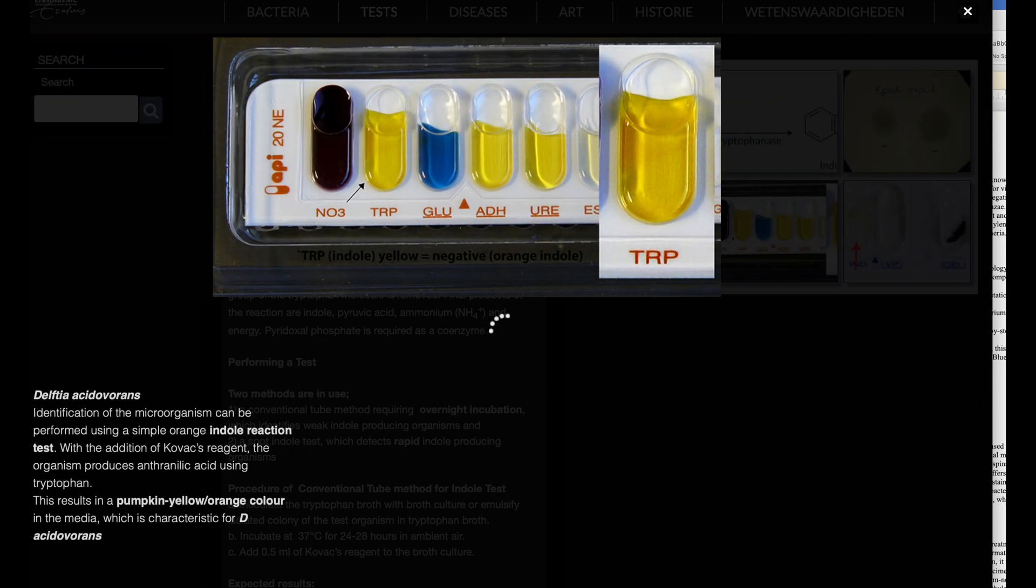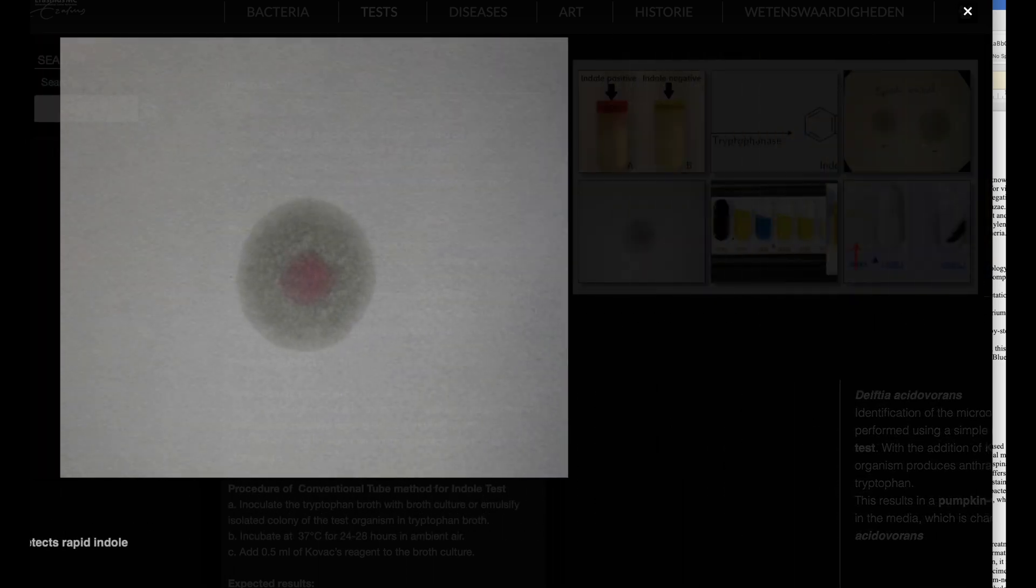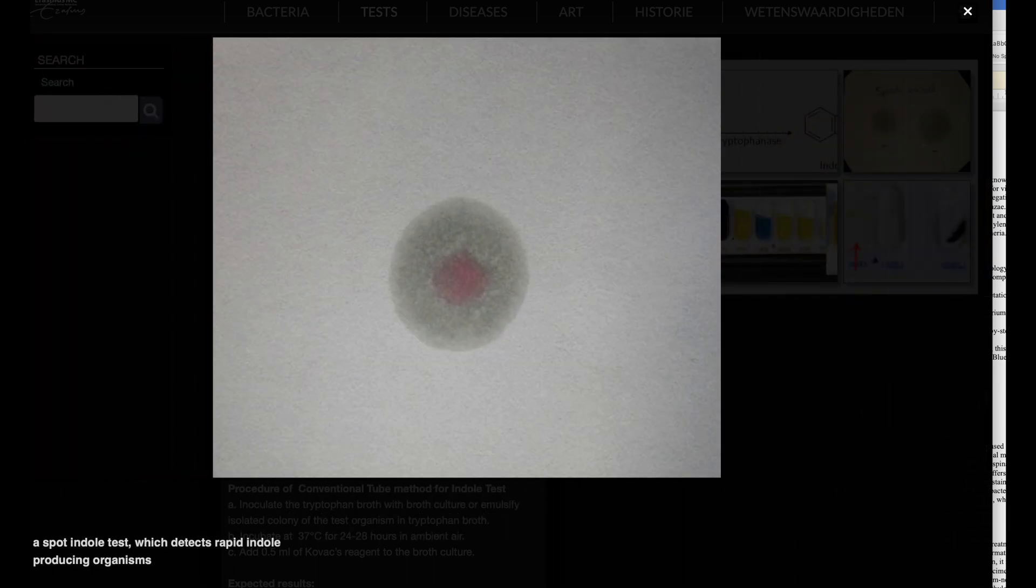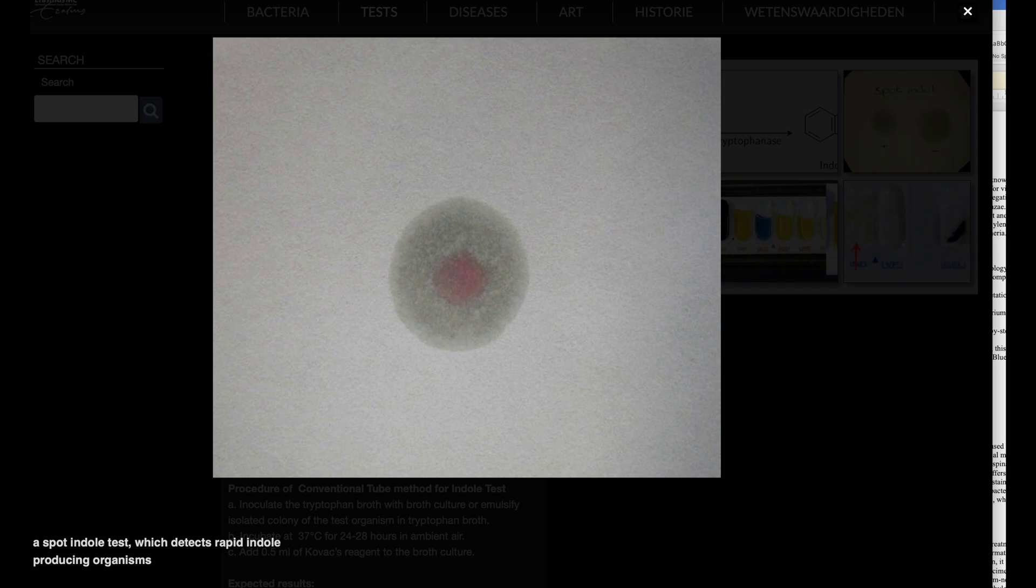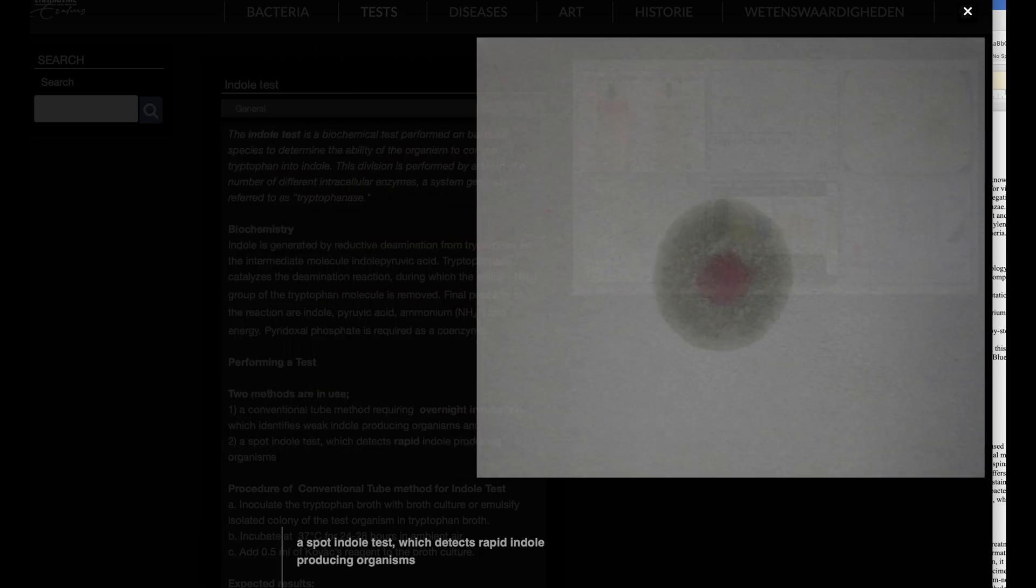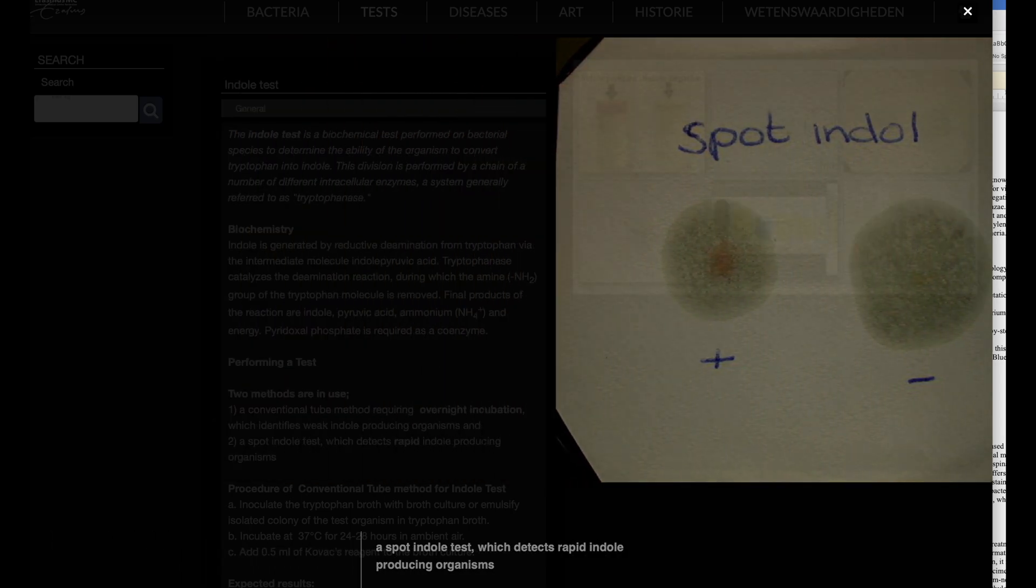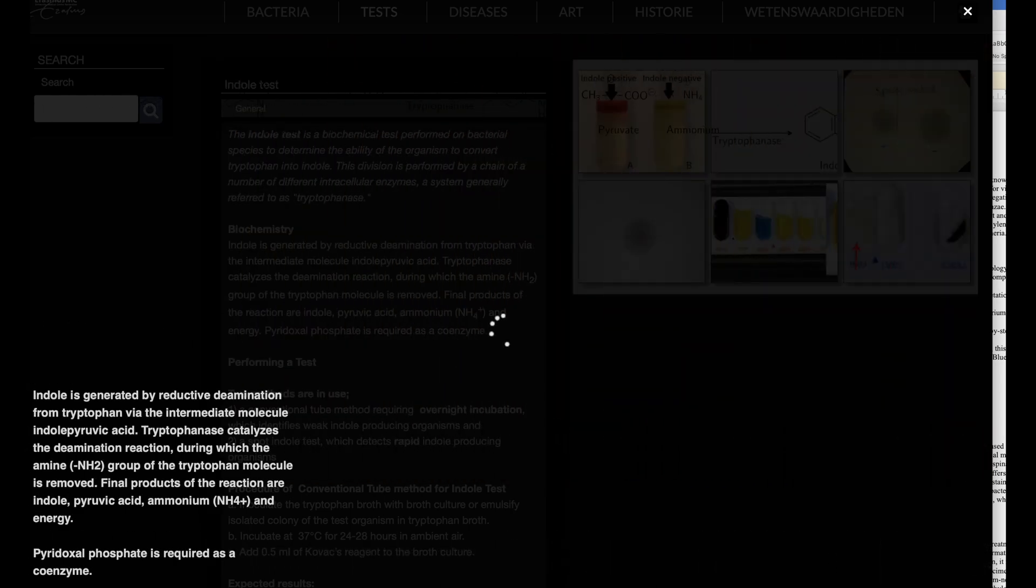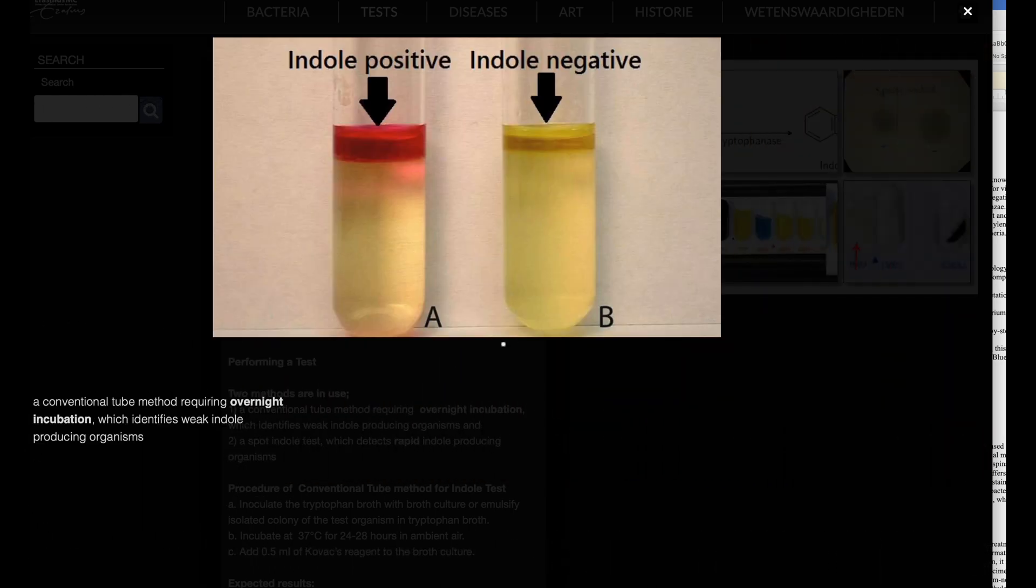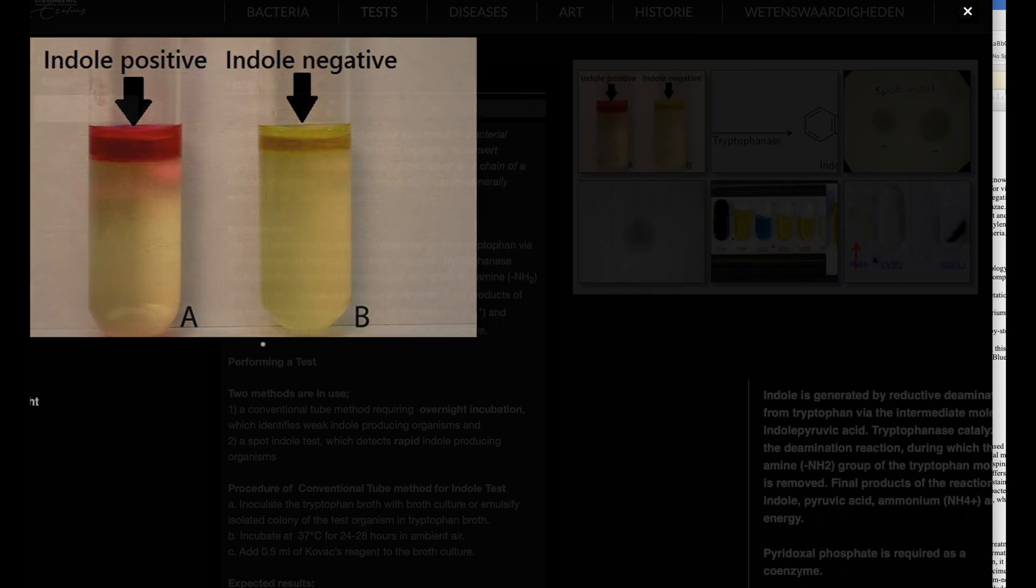Performing a indole test. There are two main methods for conducting the indole test: 1. Conventional tube method. This method requires overnight incubation and is useful for identifying organisms that produce indole weakly. 2. Spot indole test. This method is used to detect organisms that produce indole rapidly.